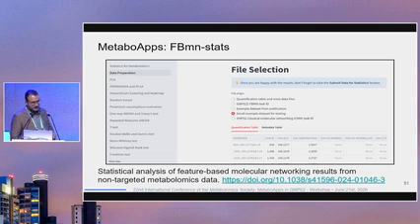But just an example, if you want to try a little bit with it and maybe ask me something later, you have more information on that. So you can use directly the quantification table and the metadata files if you want to just upload your own data and not have the GNPS job as we've done for the other ones. You can use the task ID as we've done for the drug and food readouts and the CMMC dashboard.